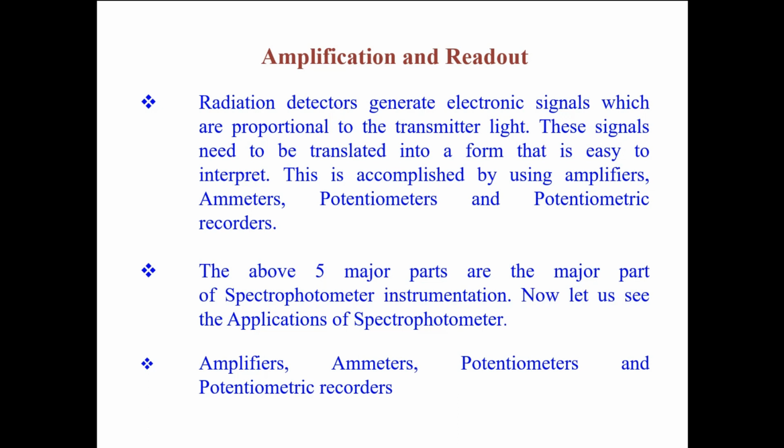So the increase is mediated by the amplifiers. The initial emitted light intensity gets amplified, and then finally it can be calculated. You know how many times you are amplifying, so based on that you can easily calculate the initial intensity or the initial concentration of a compound.